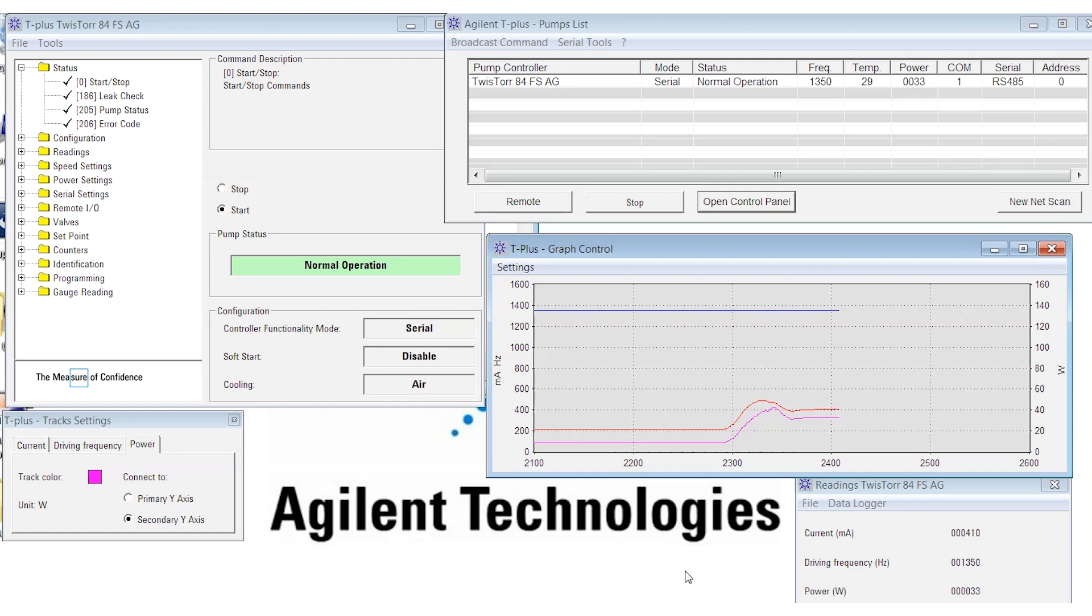So it looks like these parameters reach steady state so we can see the true effects that adding the gas load has on the pump.